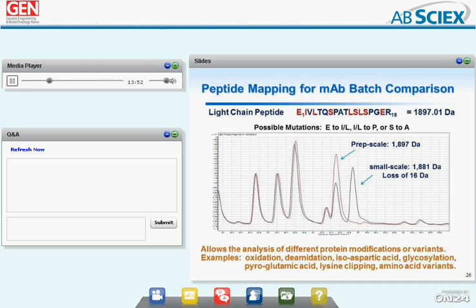We'll move to our first example, and we focus solely on peptide mapping for antibody batch comparisons. This is a light chain peptide. When comparing a prep scale batch versus a small scale batch, you see an extra peak in the HPLC chromatogram, and we use peptide mapping to identify each of these peaks. This peak of the prep scale, as being the correct peak, is shown at the top of the screen with the light chain peptide. And the small scale mass is 16 Daltons below the expected peptide mass.